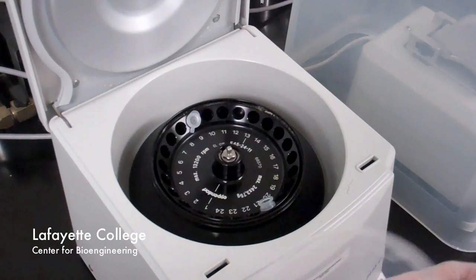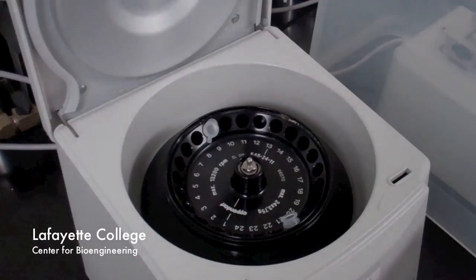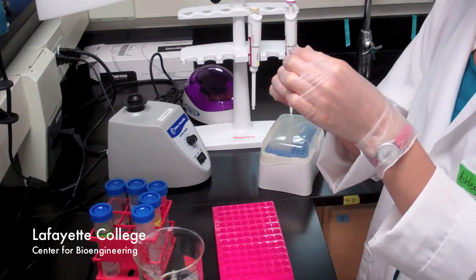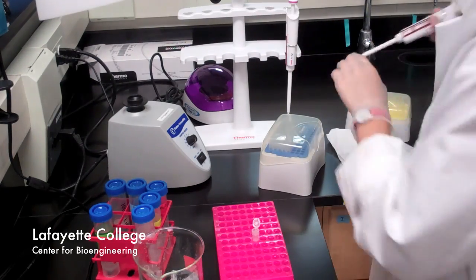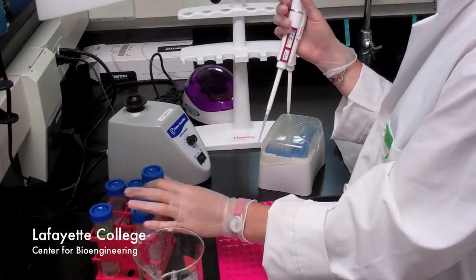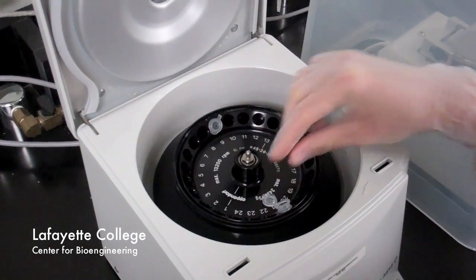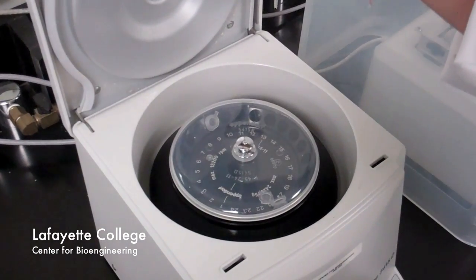After this, take the lid off of the centrifuge and allow the column to air dry for 20 minutes. After the 20 minutes, take the spin column and place it in a 1.5 milliliter collection tube with a lid. Now add 30 microliters of RNase-free molecular biology grade water. Make sure that the lid of the collection tube is in a position where it won't snap off. Then centrifuge the column for 1 minute at 10,000 RPM.